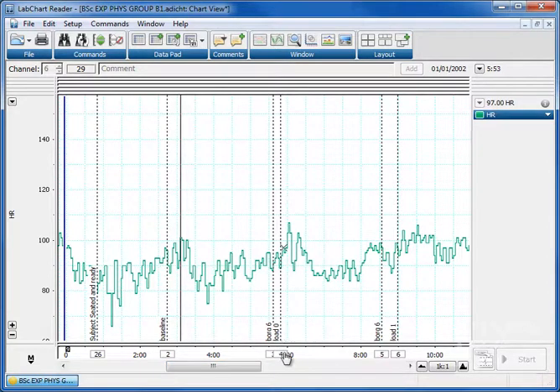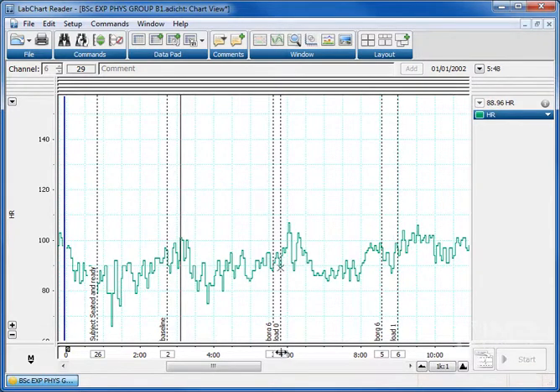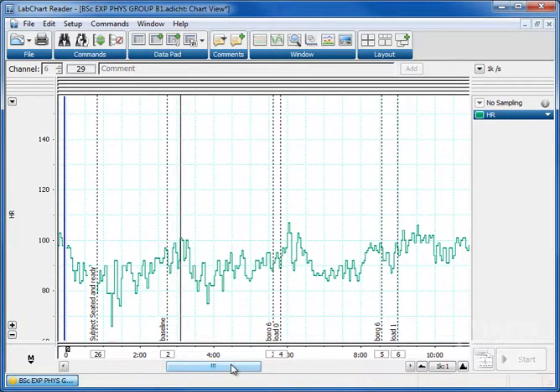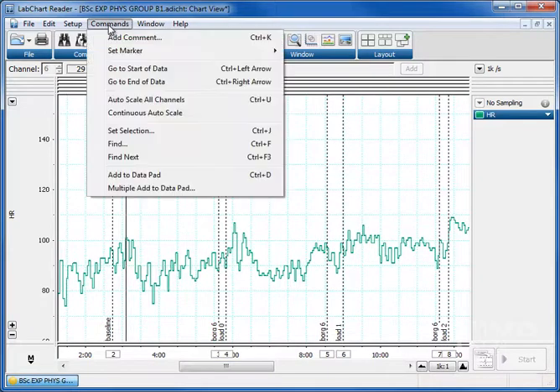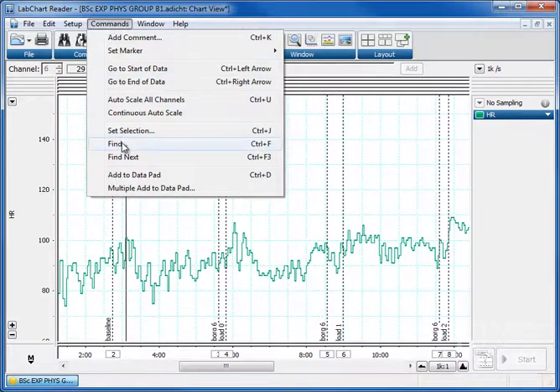We'll assume for now that the user here placed comments at the right time exactly when load switched to the higher load. It's a very quick way of doing it. It's not going to be a very long tutorial. You go to the commands menu and choose find.